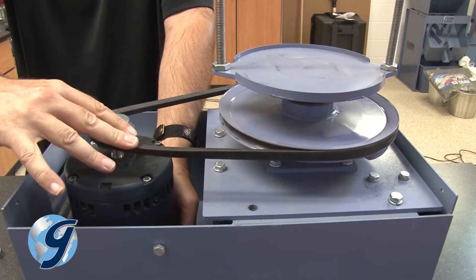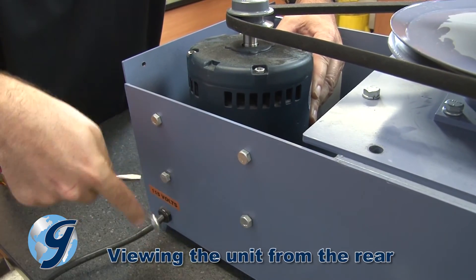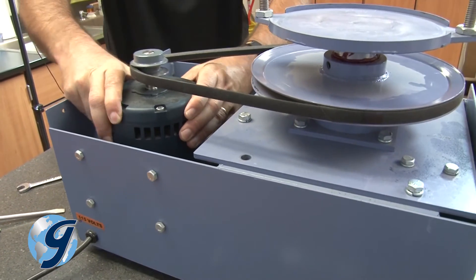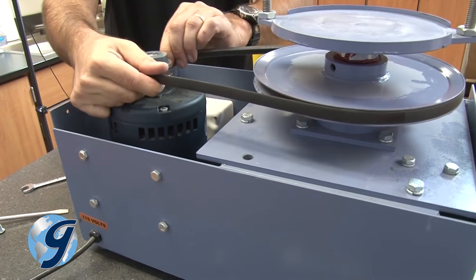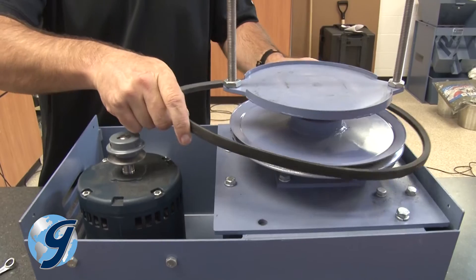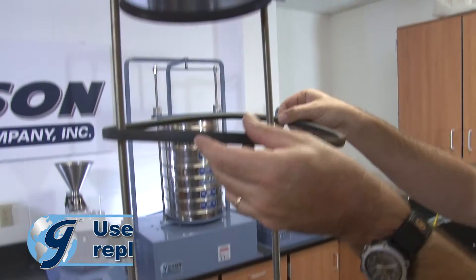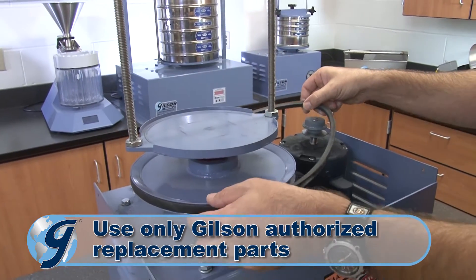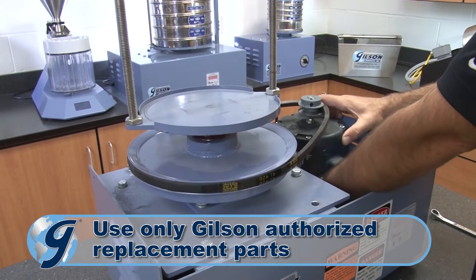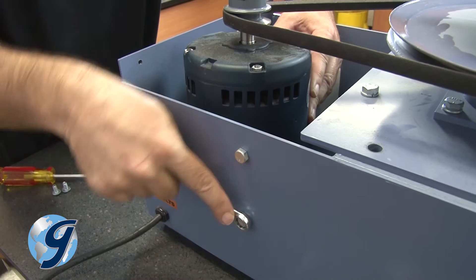If the drive belt is broken or worn, replace it by loosening the four motor mounting bolts and sliding the motor towards the left side of the machine, thereby loosening the tension on the belt. Now remove the drive belt from both pulleys and pull it straight up over the clamping system. Place the new drive belt onto both pulleys and pull the motor to the right to tension the drive belt to deflect 1/8 inch when properly tightened, and then tighten the four motor mounting bolts.